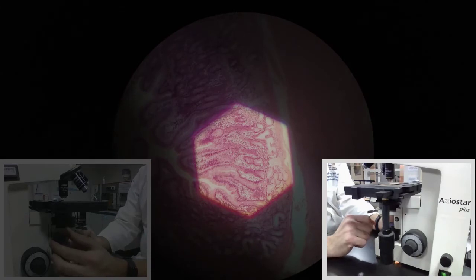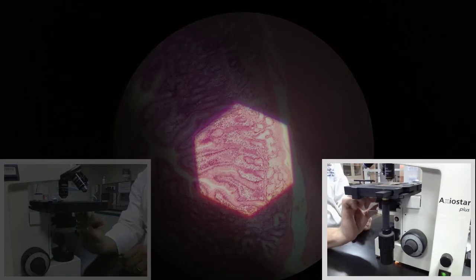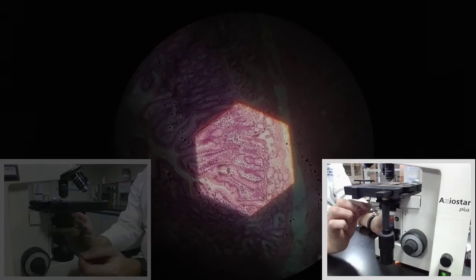You'll notice there's a bit of a color bleed — a kind of purple edge. I can use the condenser iris diaphragm control. The condenser also has a diaphragm, and you can control how much light passes through it. By sliding this controller across — we usually use that to control the contrast on our slide — in this case it helps get rid of some of that color bleed. If I go too far, I get a different color showing up on the wrong edge, so I'm just going to move it until I don't see too much bleed through.